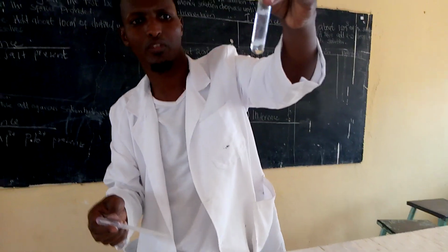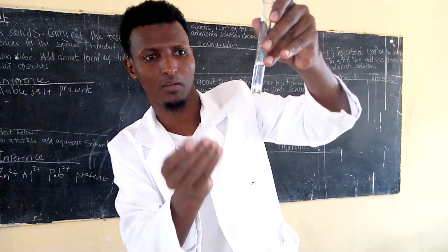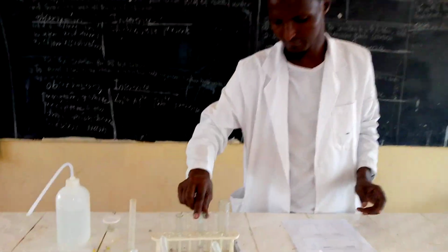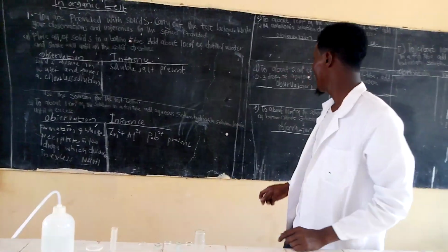I see the white precipitate is persisting at the bottom. I see it in half of the video. So that means now the white precipitate does not dissolve. Good. If the white precipitate does not dissolve, how will you write?